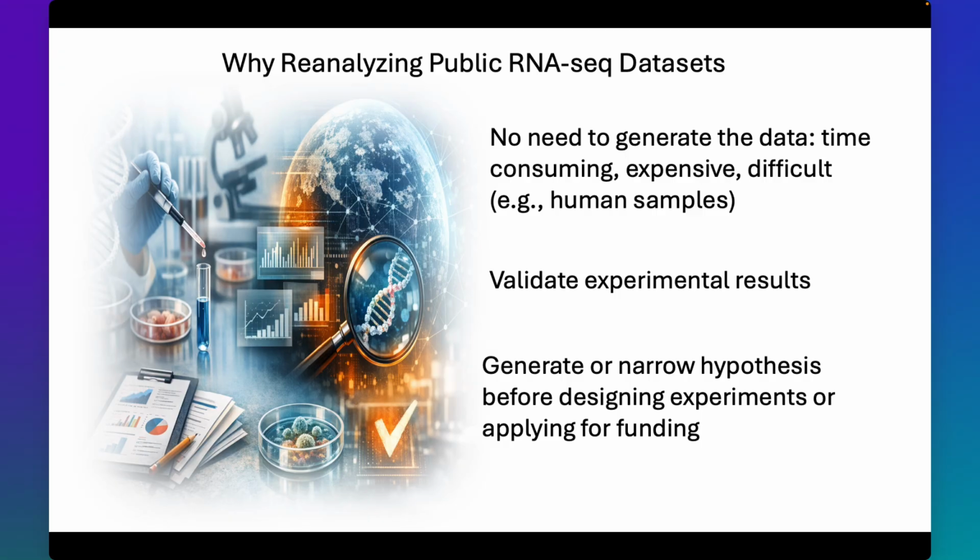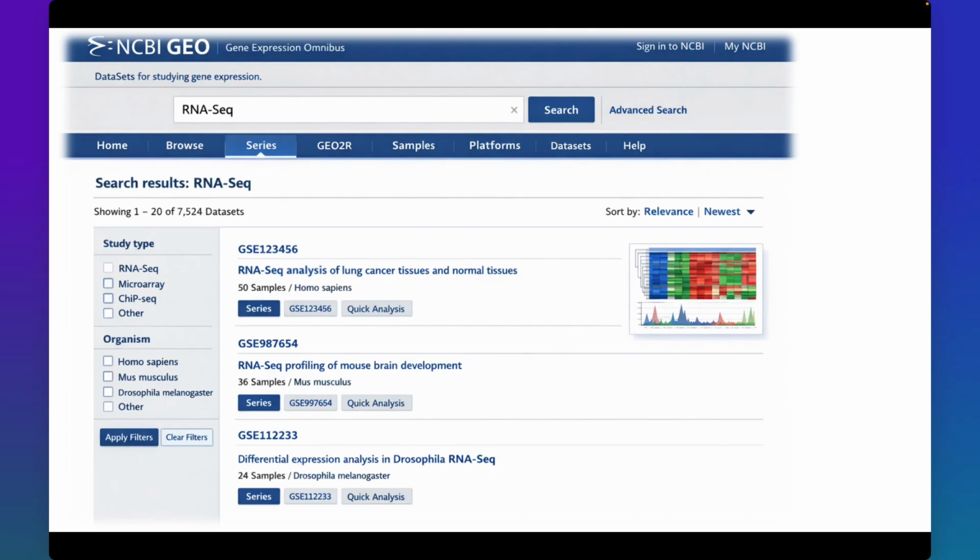when applying for funding. In this guide, we will explore what GEO2R is, what kind of data it handles, how to use its features, interpret its results, and understand its capabilities and limitations.